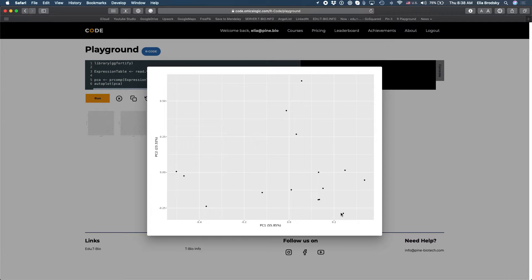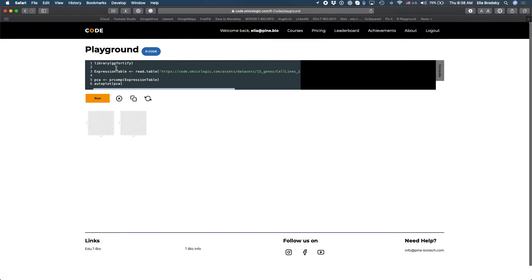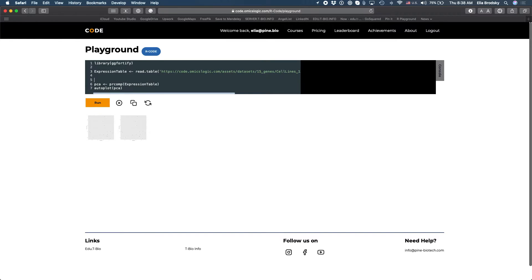Now the problem here is that this is a visualization of principal component analysis for genes instead of the objects which are the samples that we would like to compare. So to do that all we need to do is actually flip the table or transpose the table.